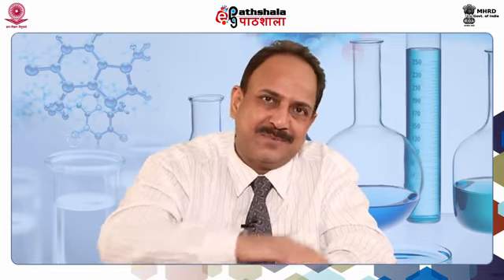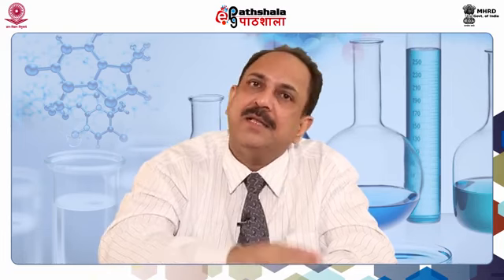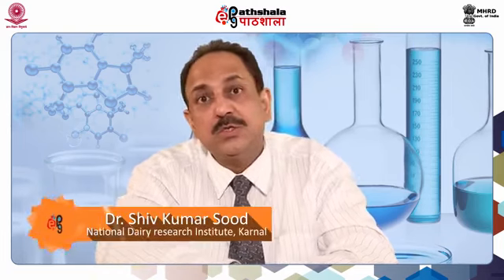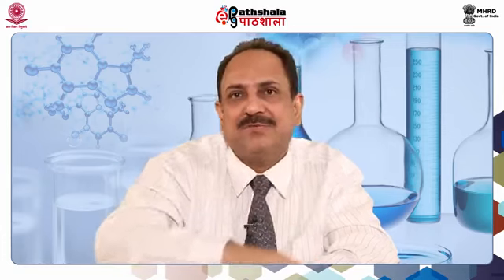This is produced from the substrate which is SHCHC. Therefore, we will use these two to actually visualize the active site of the enzyme in 3 dimensions, that is with width, height and depth of the active site.